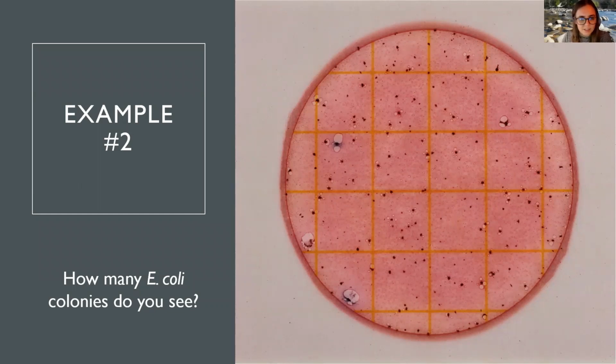Okay, all right, let's click here. On this one, we have circled 2. This one kind of does look dark, but we're not seeing that kind of smear like we can see on these other ones. That's the reason we did not count some of these other larger colonies where you can clearly see that gas bubble. So for this one, you would say 2.